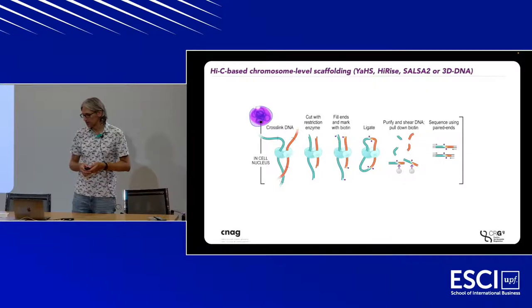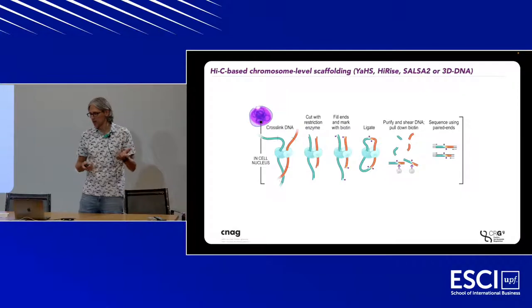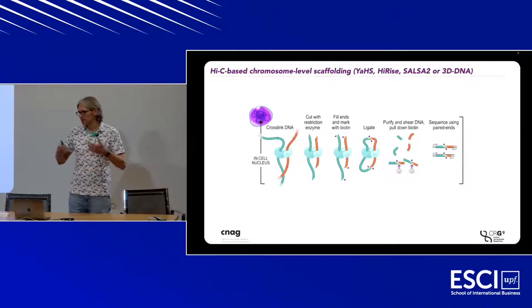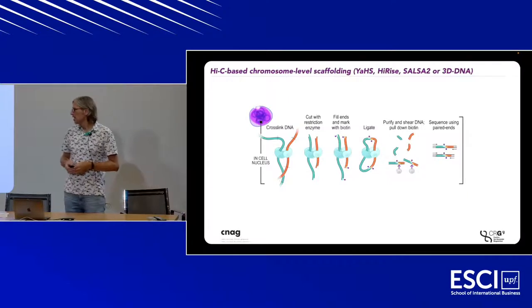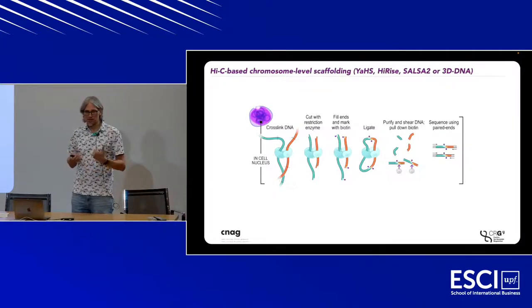It's funny, but we are now using something called Hi-C. So Hi-C is this chromatin conformation capture protocol, okay, that's been adapted to Illumina sequencing, so we can do it at scale. And people are using it, like in the CRG and CNAG, Mark Marti's group. They use it to determine the 3D structure of DNA in the nucleus.